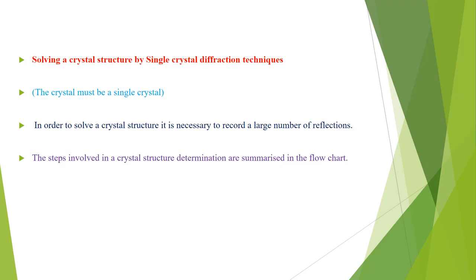And this is solved by using the Bragg equation, which specifies that a monochromatic X-ray beam of conceivable orientation of crystal is achieved, and the set of planes is also specified by using the Bragg equation.